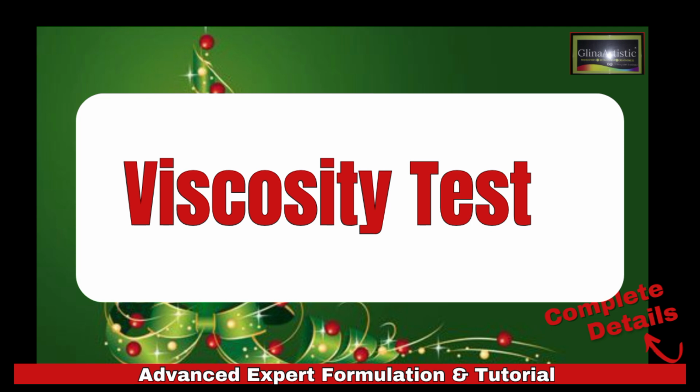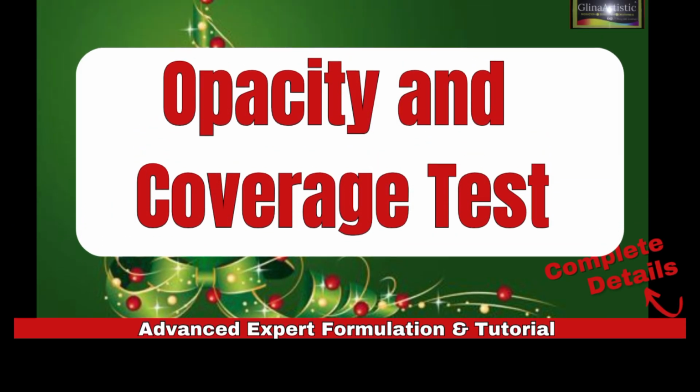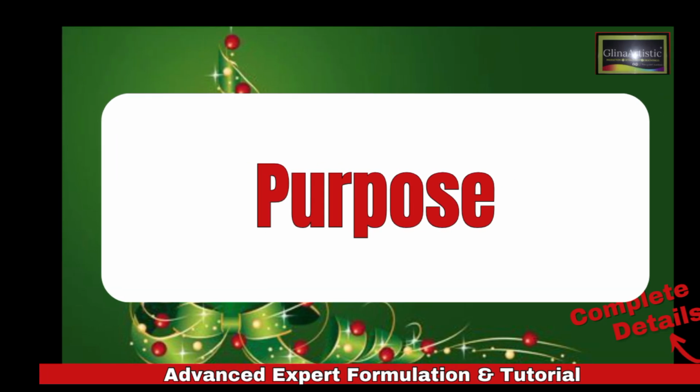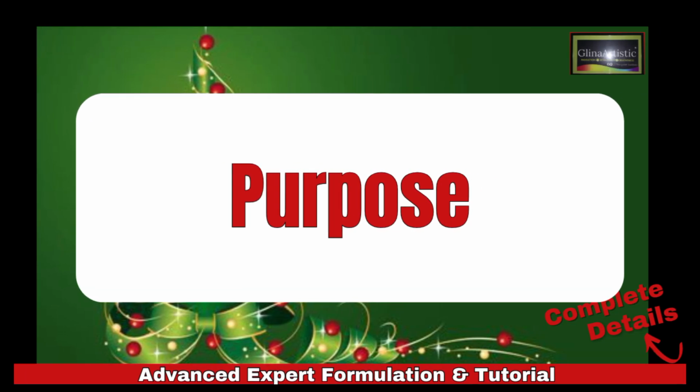So now, under the opacity and coverage test, number one, you have to determine how well this paint hides the surfaces underneath. That is all the grammar of the word you've been hearing about, opacity and coverage. You understand? So if this paint does not hide the surfaces underneath, that is to say, if you apply this paint and you're still seeing the underneath of the wall, it simply means it is poor coverage.